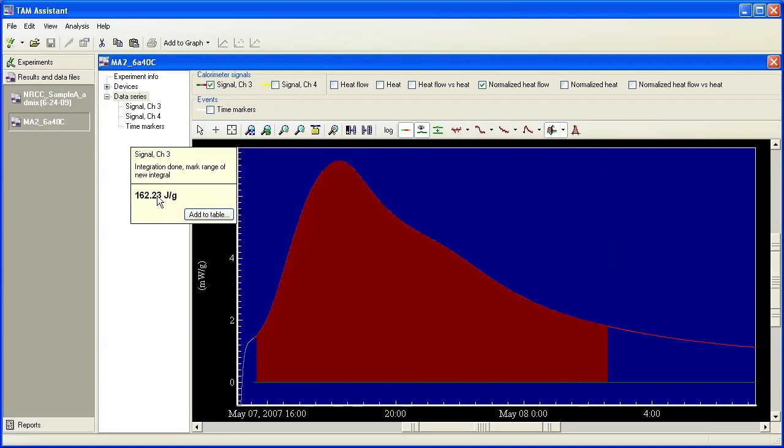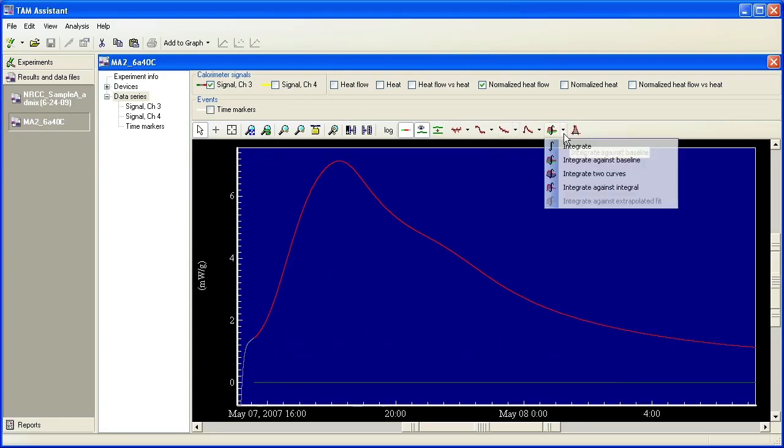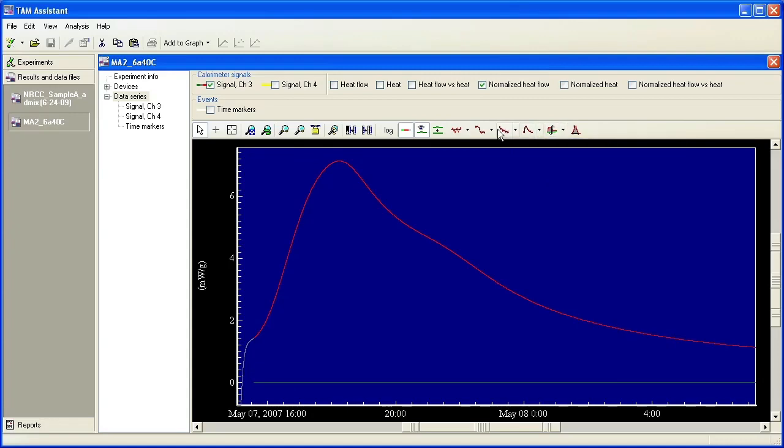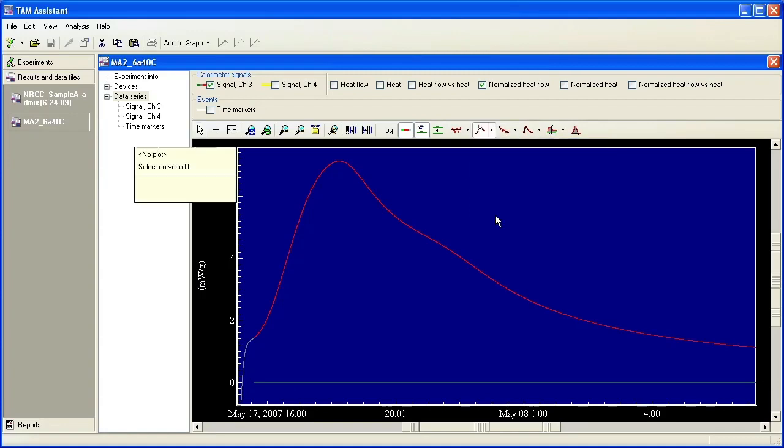Again, it's an exothermic. There's one alternative way to integrate and it's called integrate against extrapolated fit which is grayed out here because first we must draw a baseline of a baseline sigmoid here. So I'm going to choose slopes, baseline, sigmoid.